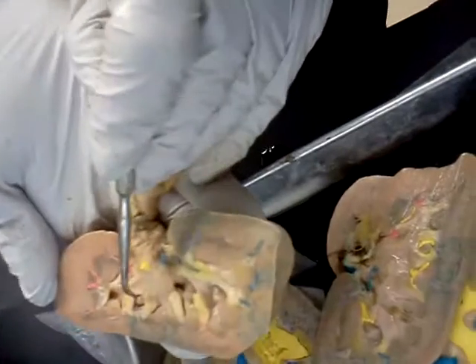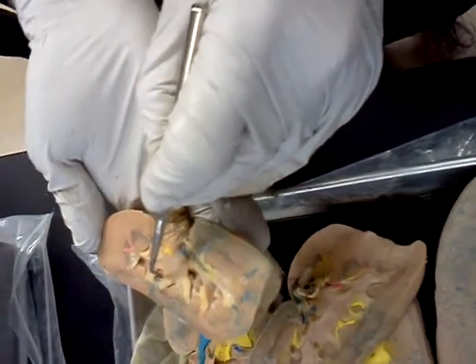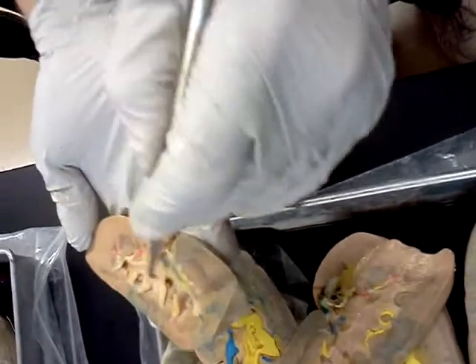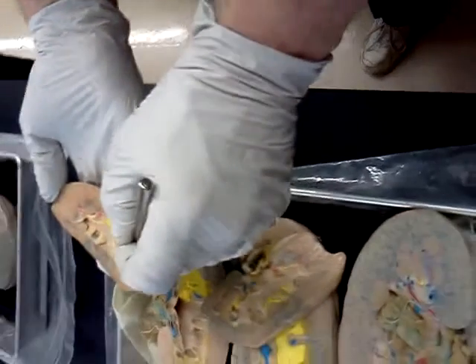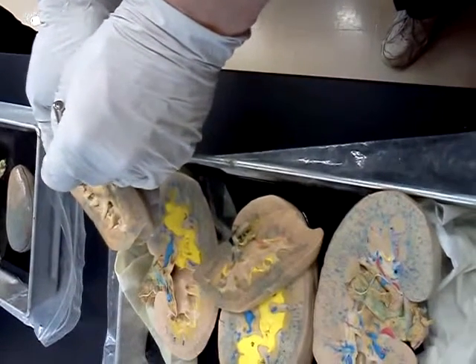The little round nubs here, like you see right here, and also, sorry if you can't see it, right at the top here, that would be a renal papilla. That's where everything comes out. That's typical, where basically it empties into the opening that surrounds it.